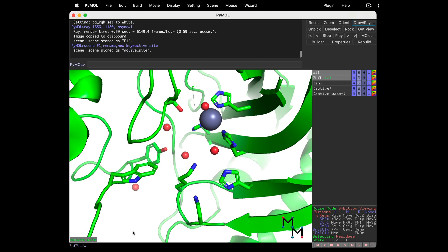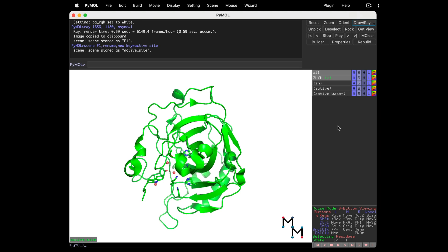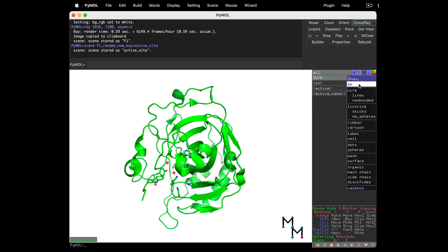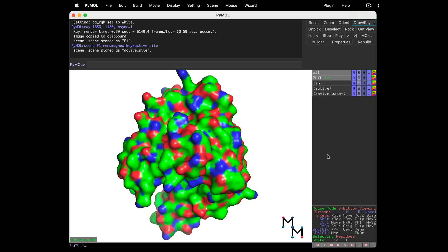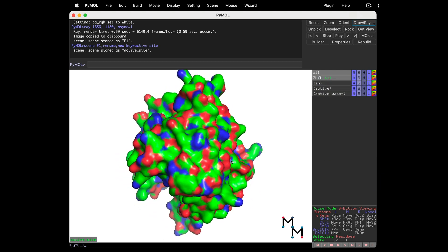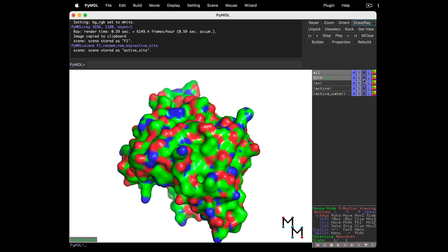Let's change the whole rendering to see how scenes work. Next to 3uyn in the Names panel, Action button, A, Zoom. This zooms out to show the entire protein. Now S button, Show as, Surface. Rotate the protein and reorient it a little bit. Let's color it a solid color.